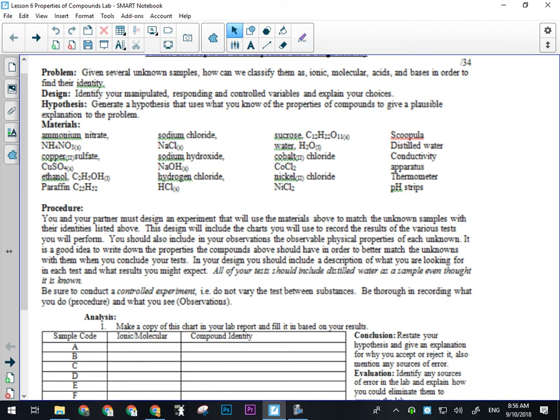And you should have the same amount of the unknown substances. Absolutely. I'm going to let you guys come up with a third one. Each of you might have something different, but we've come up with 2 out of 3 there. Things to think about for that third one could be environmental, things that could affect the tests that might be environmental in nature. Be more specific than that. Don't write things that are environmental in nature as your control variable. Come up with a specific environmental thing.